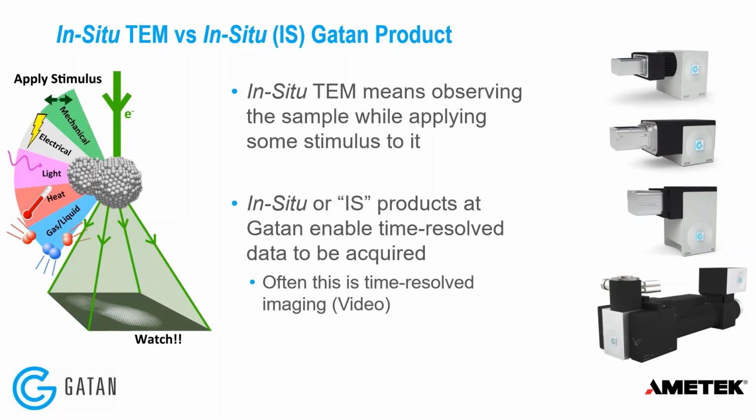Whether an in-situ stimulus is being applied or not. And often this is time-resolved imaging to produce videos, and that's going to be what I talk about mostly today. But we're also starting to develop products like the Continuum IS that you see here, which can do not only time-resolved video, but also time-resolved spectroscopy.